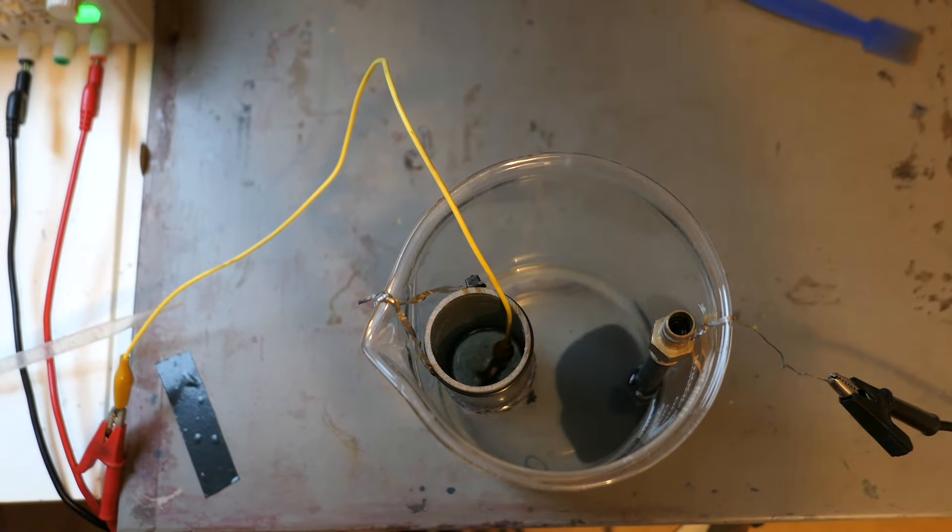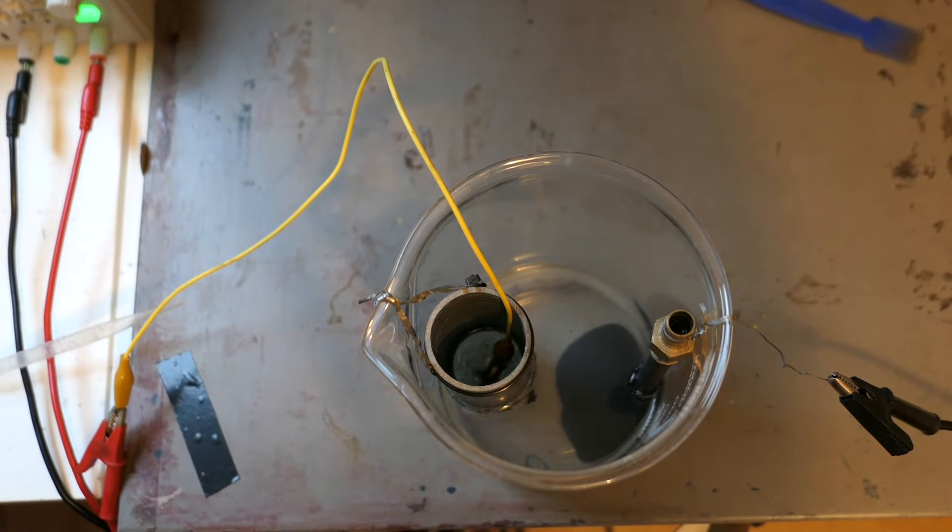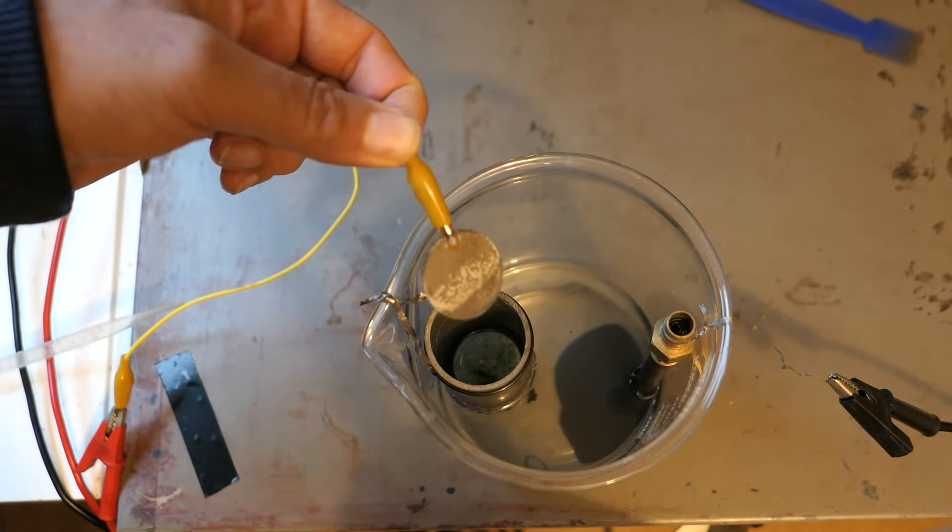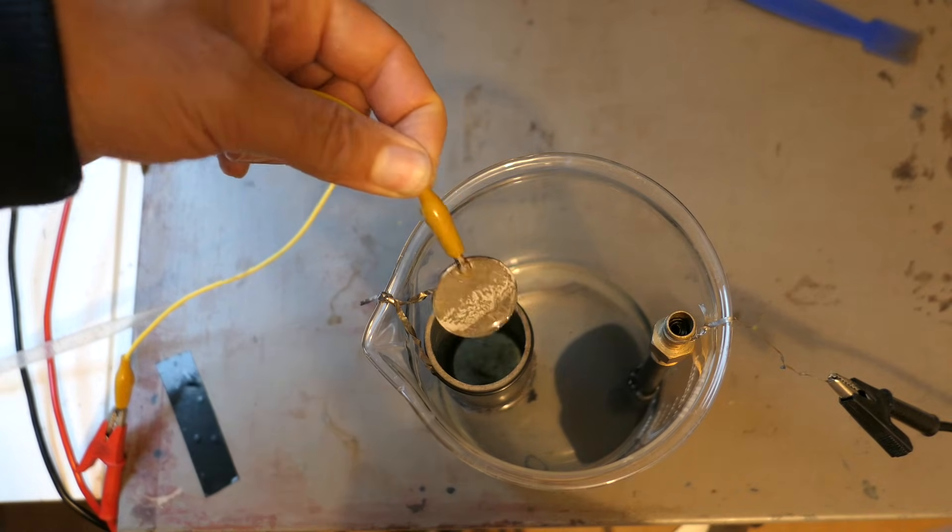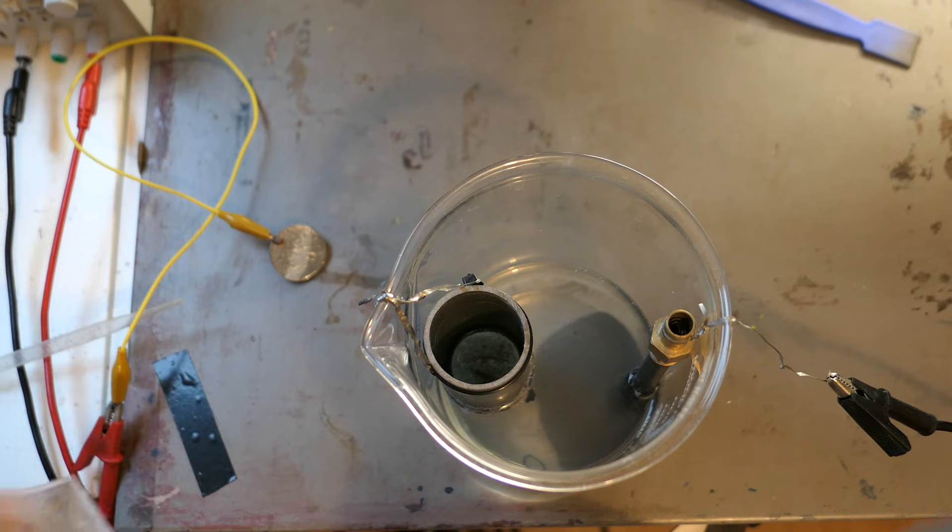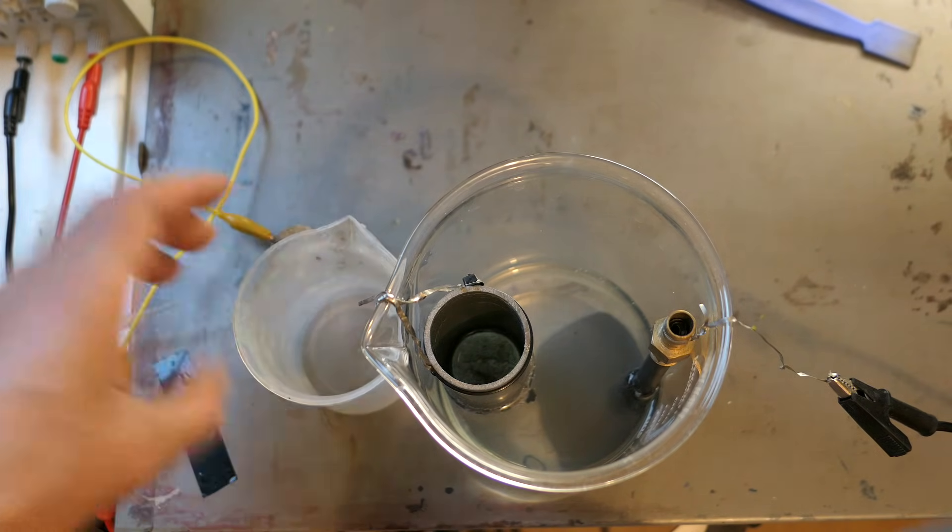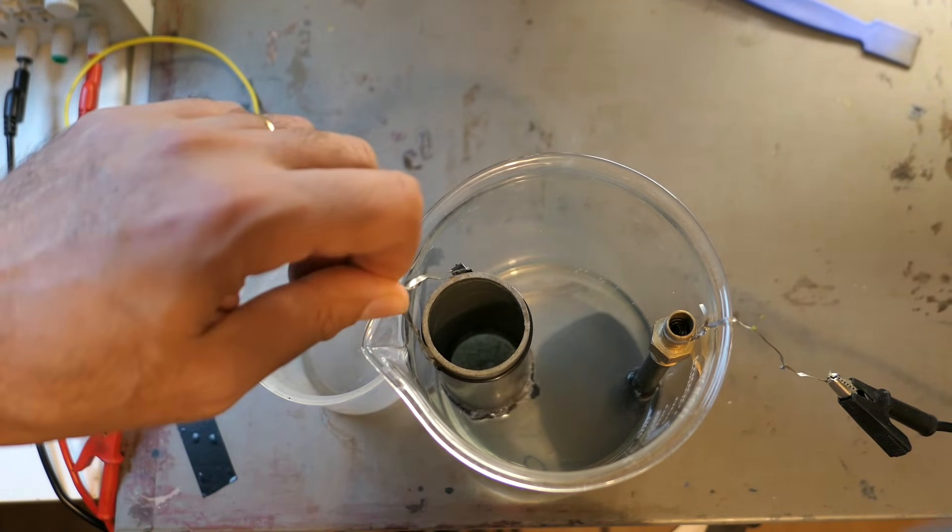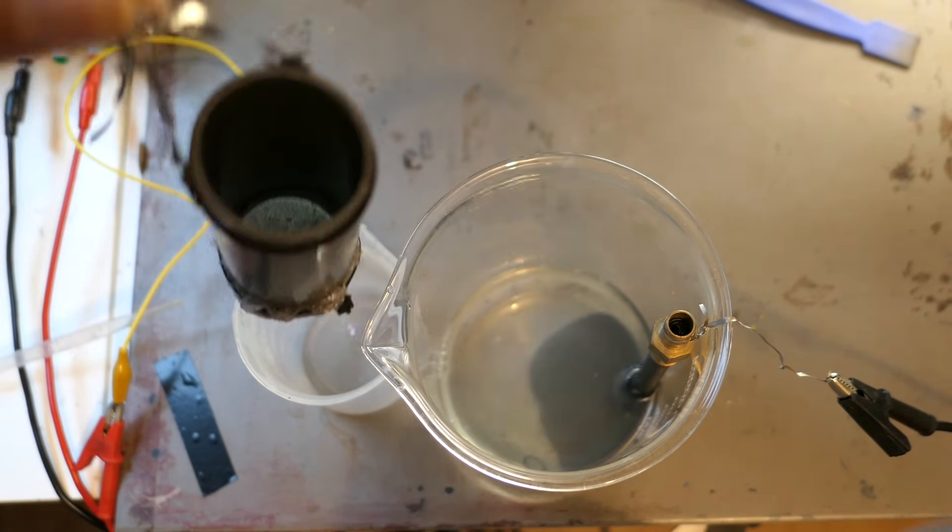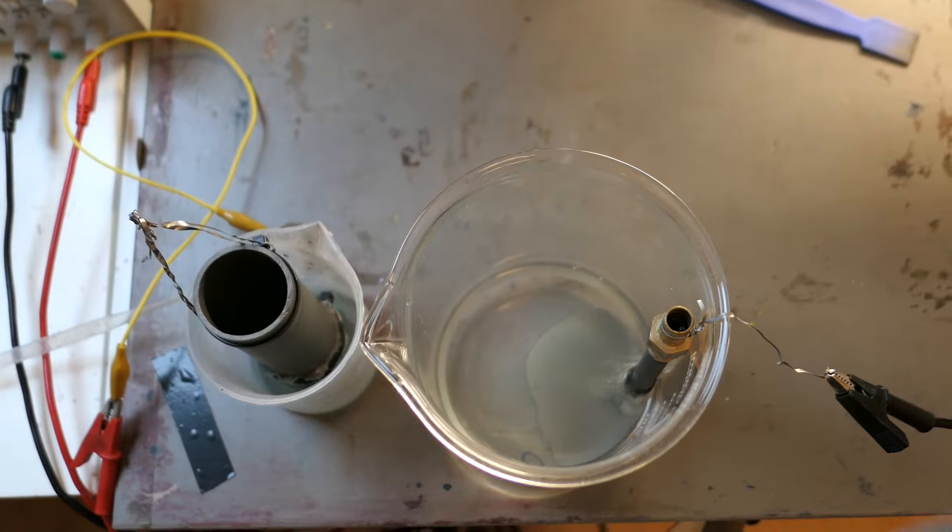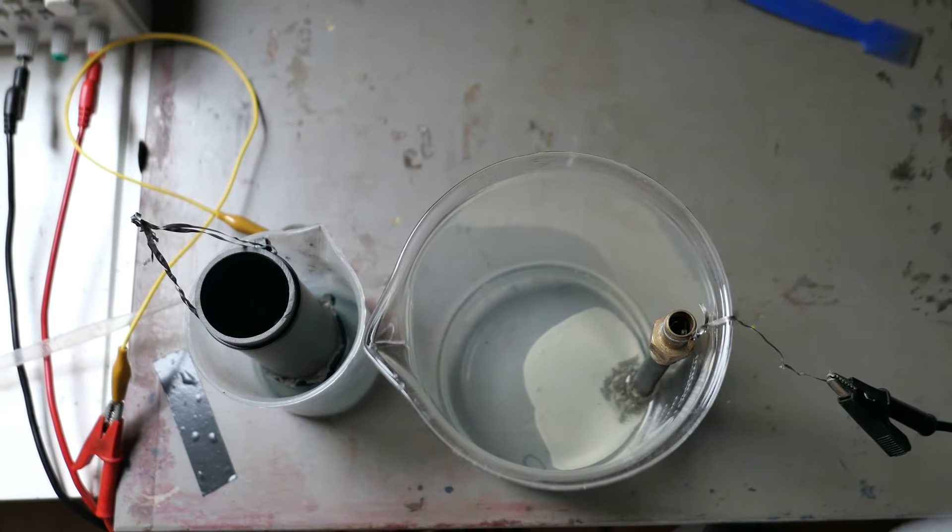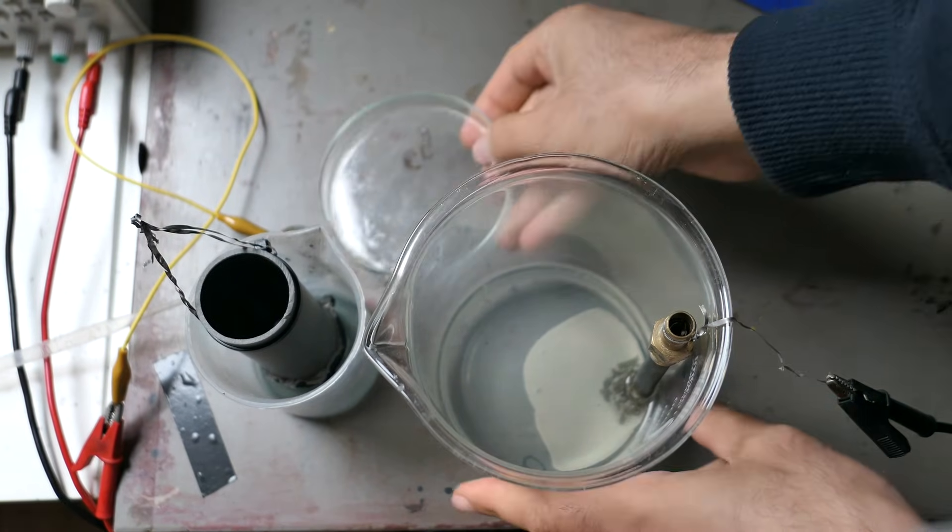One interesting thing you'll see during this process is how the silver deposit on the cathode changes over time. At the beginning, the deposit looks dark, almost black. When we finally turn off the power, something interesting happens. The silver deposit starts to turn into a more familiar, shiny silver color. I'm not entirely sure why, but if any of you have more experience with this, I'd love to hear your thoughts in the comments. Feel free to share your theories or any insights.